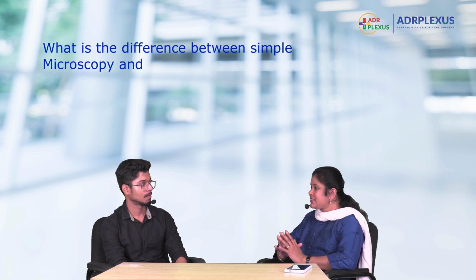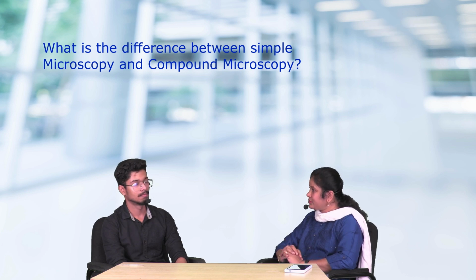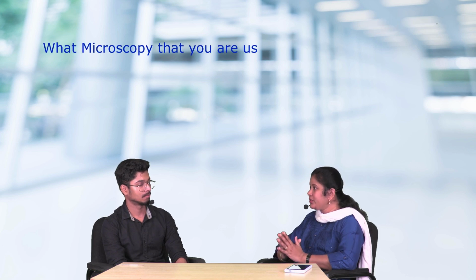Now, what is the difference between a simple microscope and a compound microscope? Simple microscope has only one lens, and it does not have the condenser, ma'am. And it has only the concave mirror, ma'am. Whereas in the compound microscope, we have two sets of lenses, that is the eyepiece and the nosepiece. It has 3 to 5 lenses. It has the condenser, and it has both concave mirror as well as the plane mirror. Very good. What microscope are you using in the lab? Compound microscope. How many lenses were there in that? 3 lenses, ma'am.